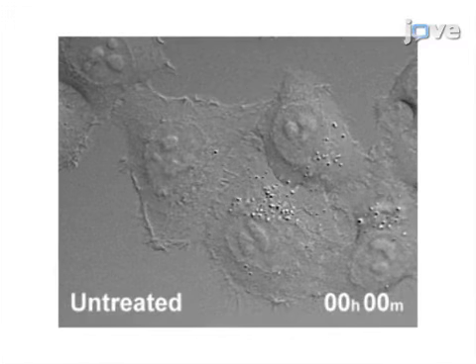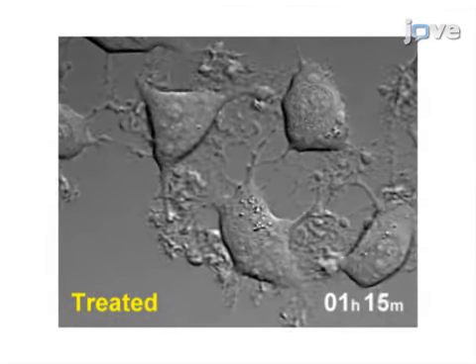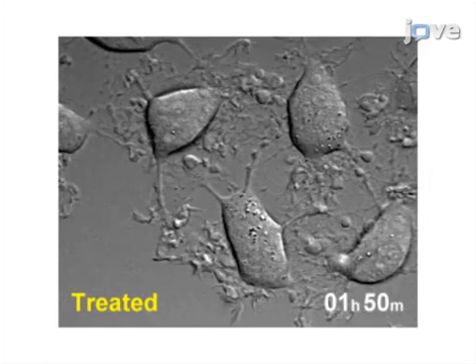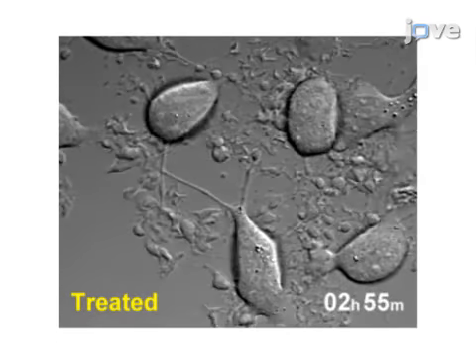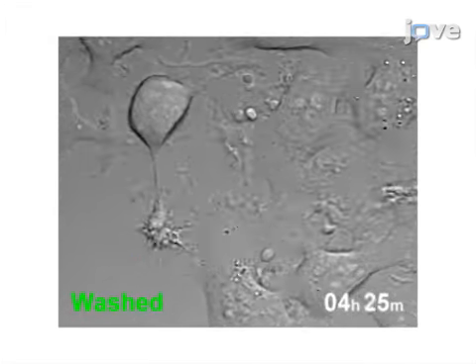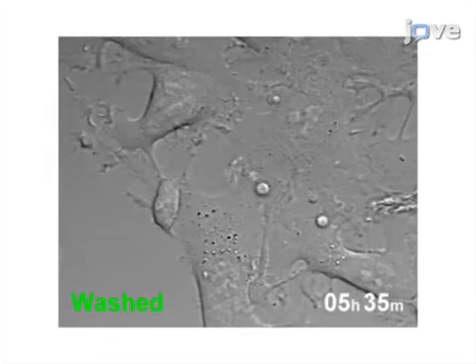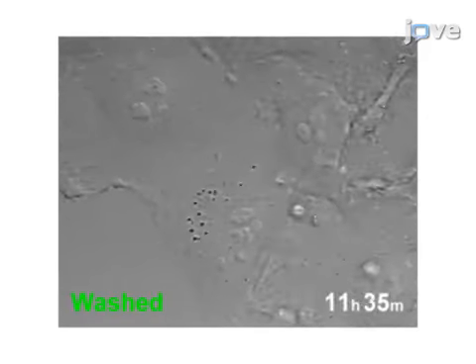Live cell microscopy shows that apoptotic dying cells display unique morphological hallmarks such as plasma membrane blebbing, nuclear condensation, and cell shrinkage. In general, these cells are expected to die. However, after washing and incubating the dying cells with fresh medium, they undergo anastasis, recover, and can later divide.